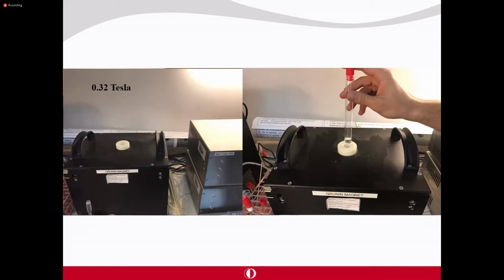But the main difference between these systems and the one that I talked about initially is that those are high field and these ones are low field, which doesn't let us obtain a chemical characterization, but which lets us do some other analysis, which I will explain in the rest of the lecture.